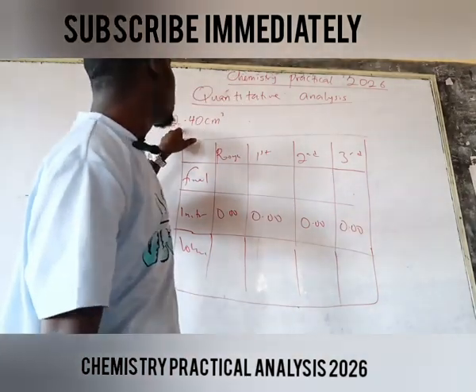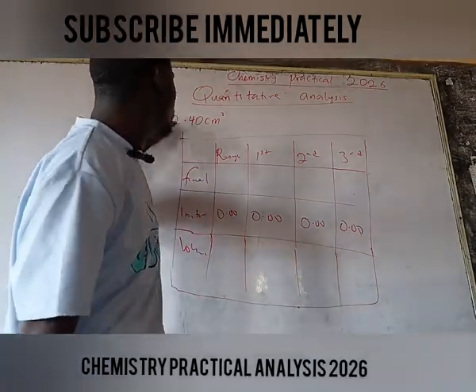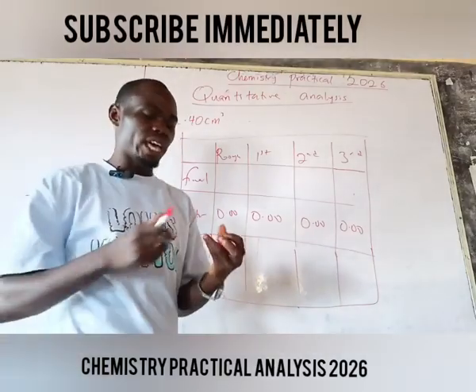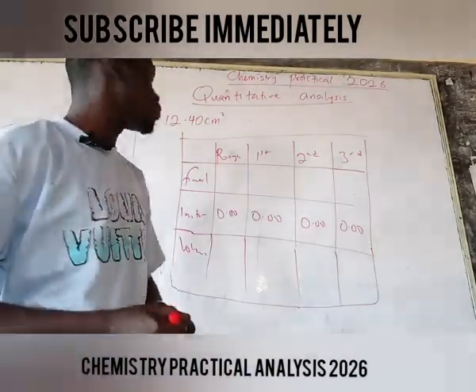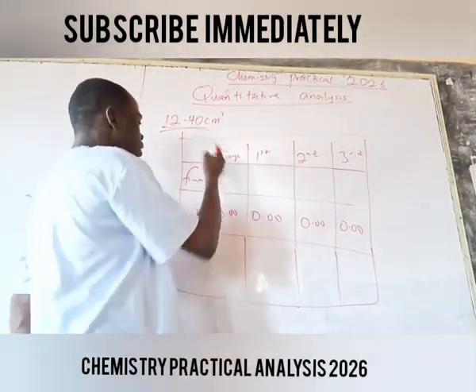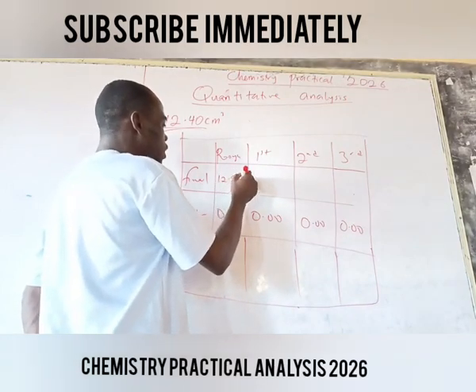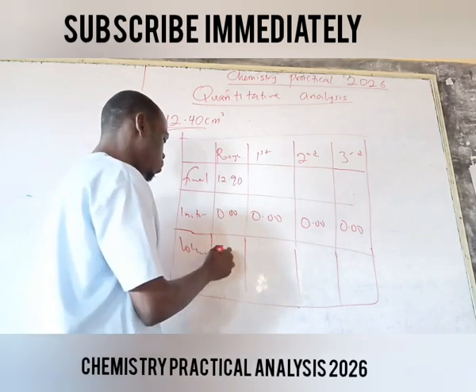Although due to this analysis of 12.4, it is not practicable to start with 12.00. You can use a burette throughout the analysis, but let's start with this rough sketch. In this rough sketch, I want to get 12.40. So in my rough reading, I can still have 12.90. It is acceptable, whereby the volume used will be 12.90.